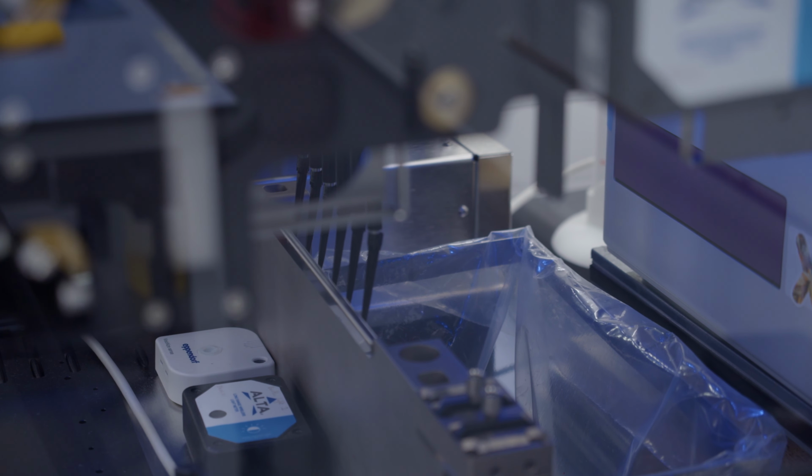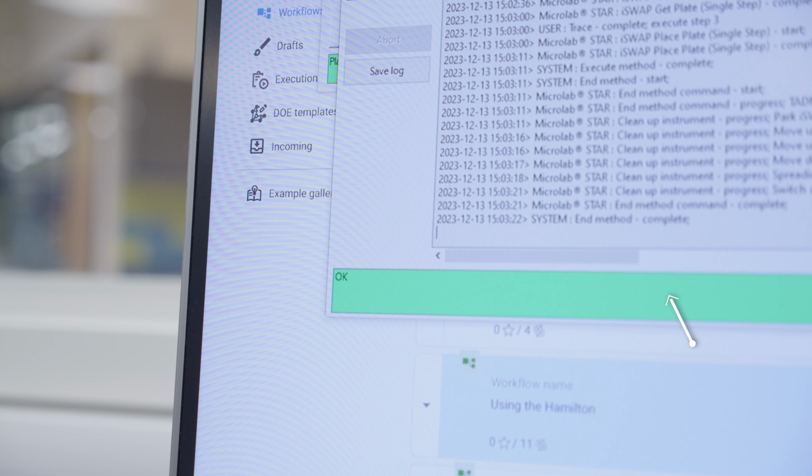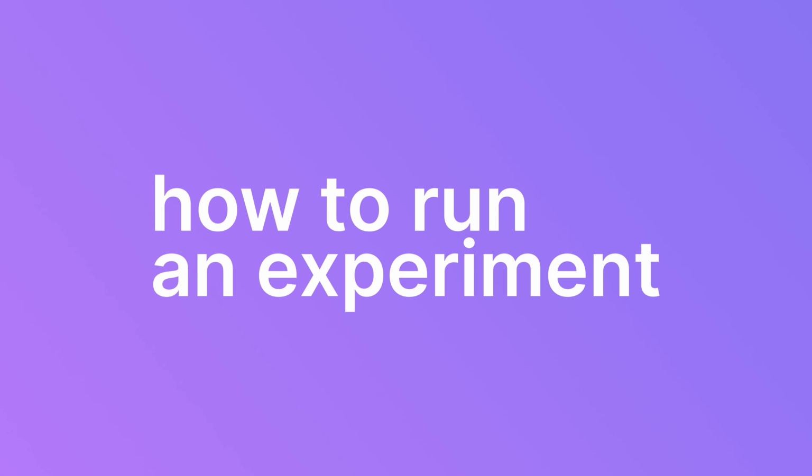Once the run's finished, the device plugin on the computer will say method complete. And that's how you run an experiment on a Hamilton STAR using Synthace.